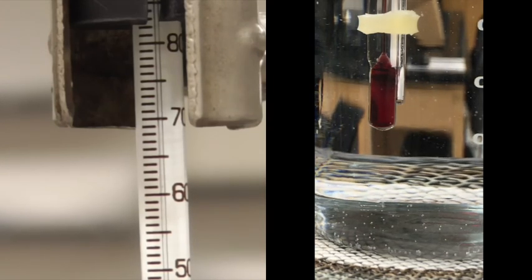And it's looking like it's about 40 degrees right now, the water temperature. So 40 degrees Celsius, right? These temperature measurements are in Celsius.